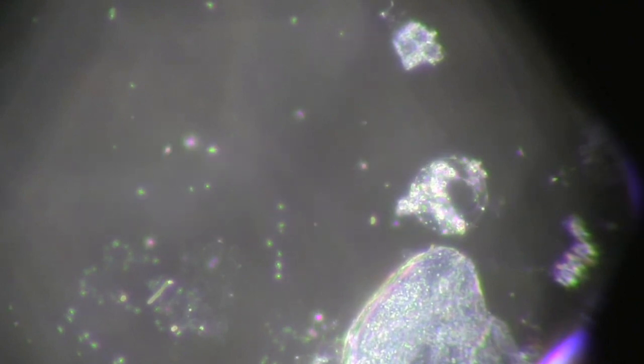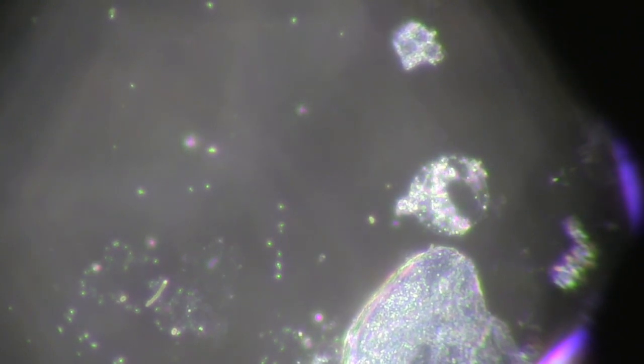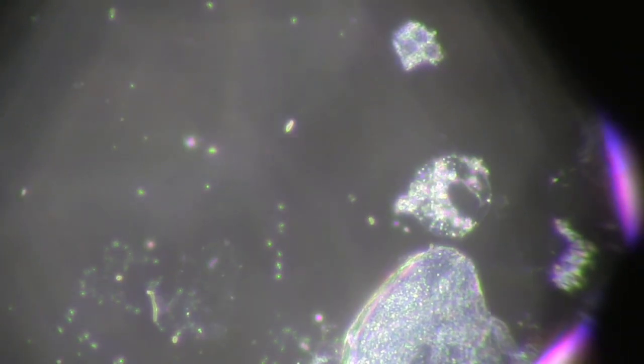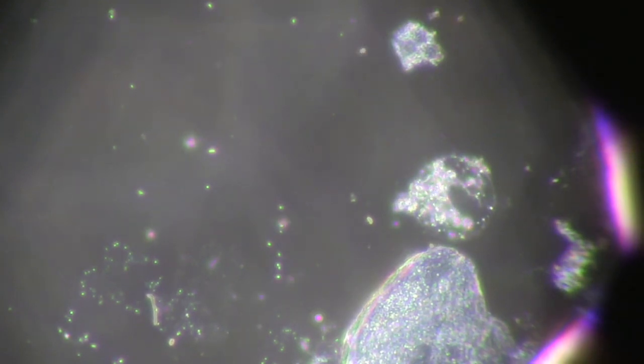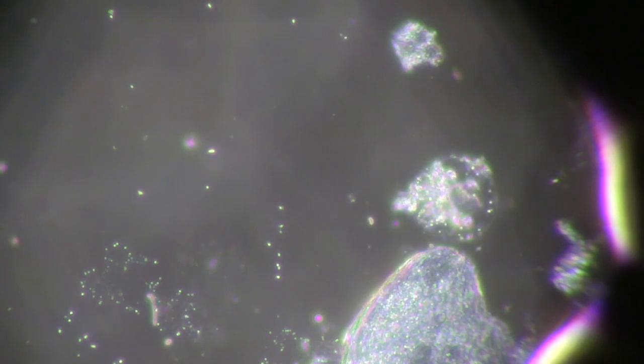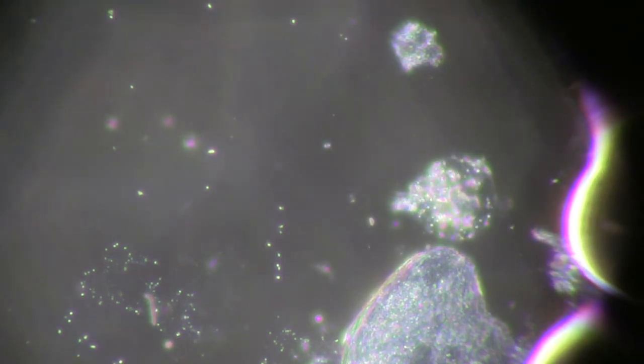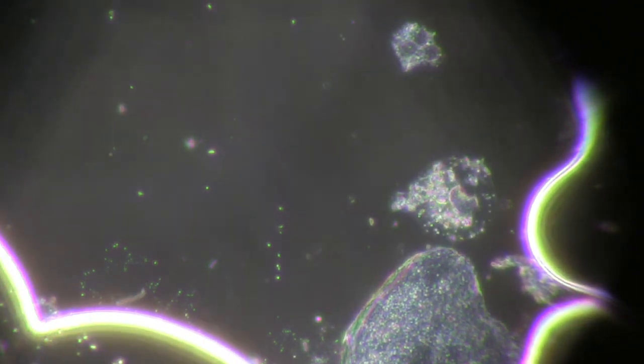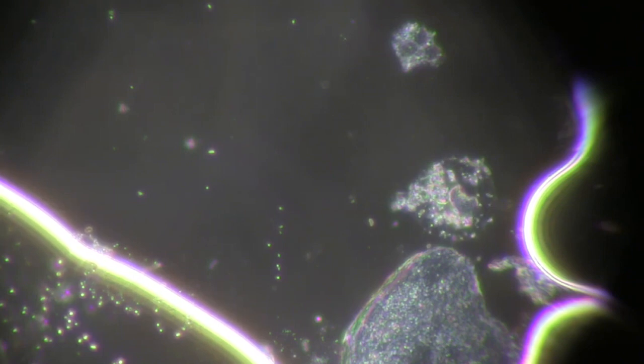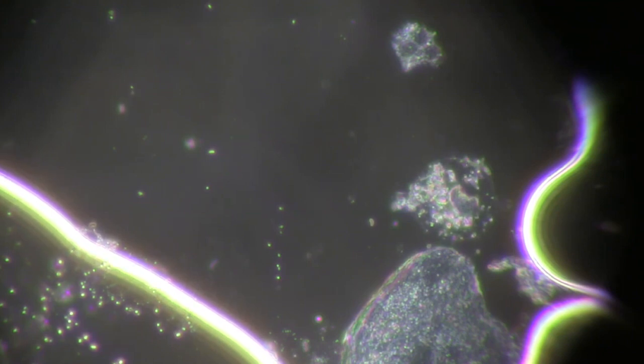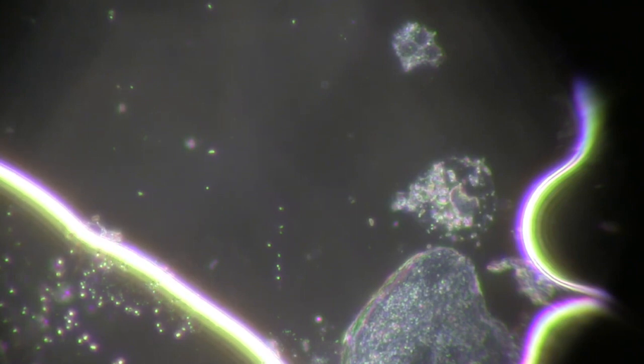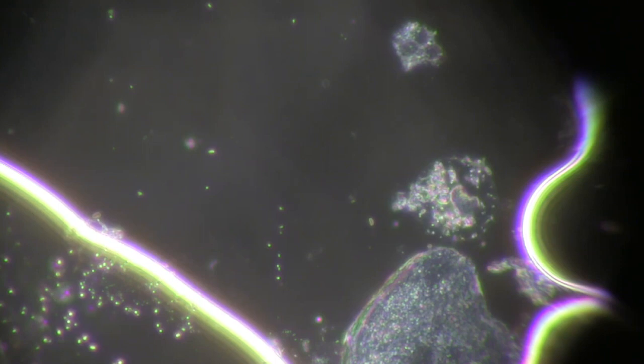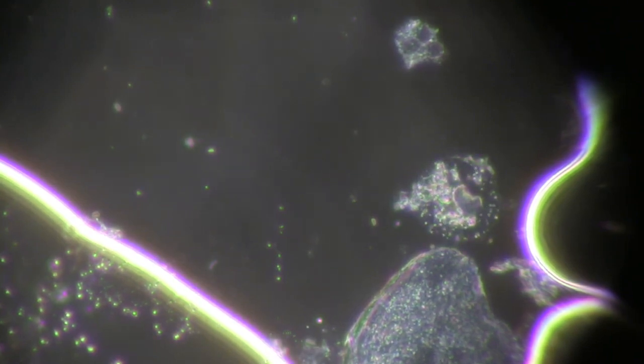There's a good biofilm. Well, this was a full biofilm. Right. And we're watching it dissolve. Isn't that crazy? In other words, literally dissolve. And unfortunately, our sample is drying up, so, yeah. Yeah. Look at the one up above. It's got three spots on it down. Yeah.